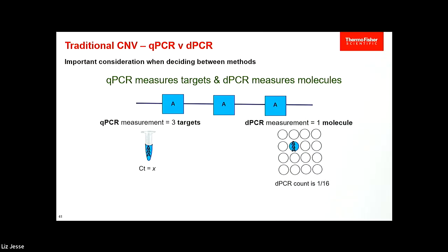In digital PCR or even in regular PCR, if you envision qPCR will take your sample. Now, if you are doing any kind of gene editing in particular, this is a unique application. But in a gene editing scenario, when you're trying to put an insert into the gene, how do you know where it landed? Well, usually you're hoping for a 1 copy insertion.